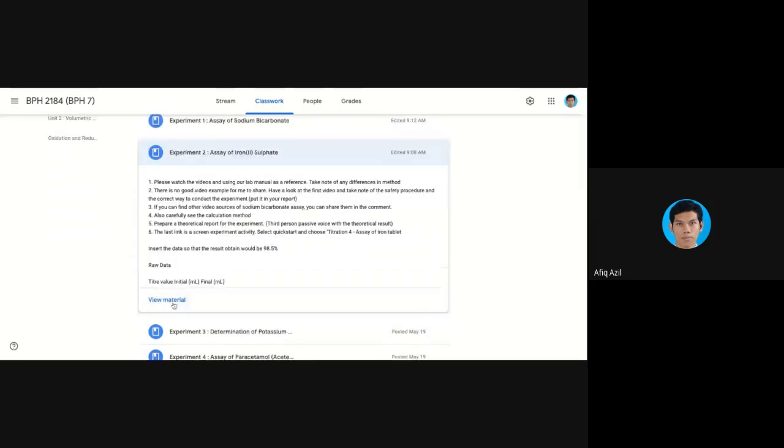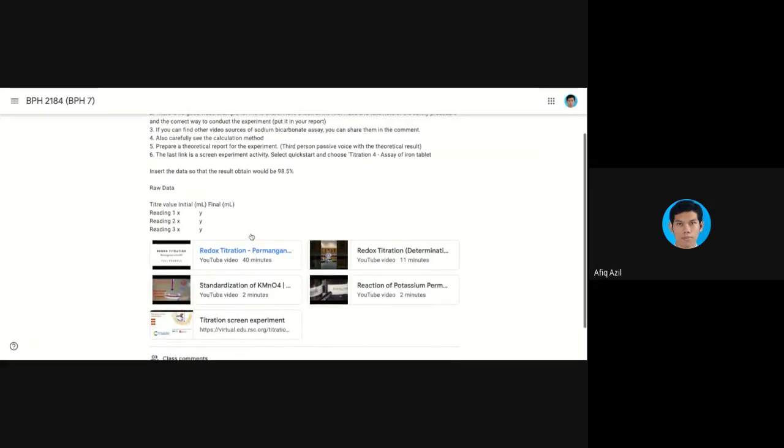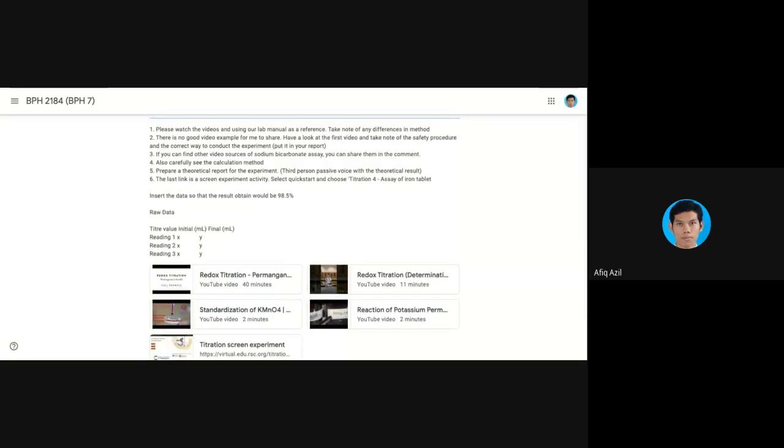Let's see some of the videos that I've put. There are 4 videos over here. The first video, I want you to watch later, but it is 40 minutes, so I'm going to show the other videos, which are shorter. But the first video is a very good example because it shows the steps meticulously from standardization up until the titration part.